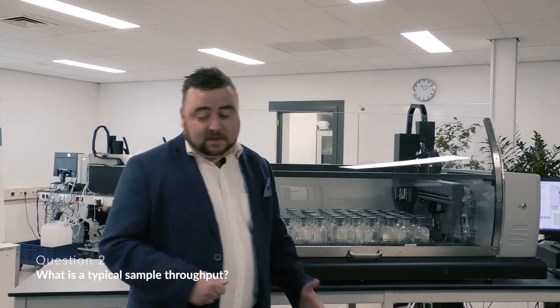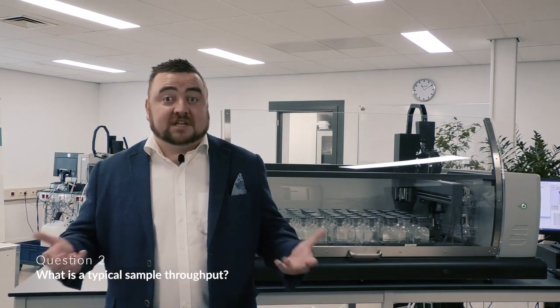what is a typical sample throughput? So based on a single probe configuration, we specify about 80 to 90 bottles per hour, and by adding a second dissolved oxygen probe, this could actually move to 150 or 170 perhaps bottles per hour. So here I'm referring to the DO measurement only.